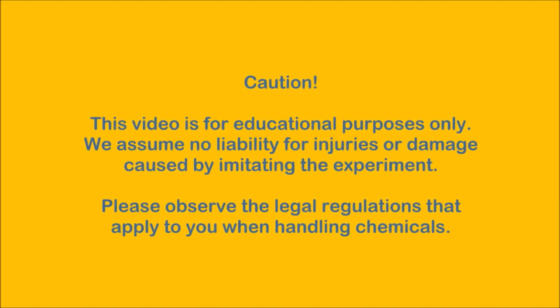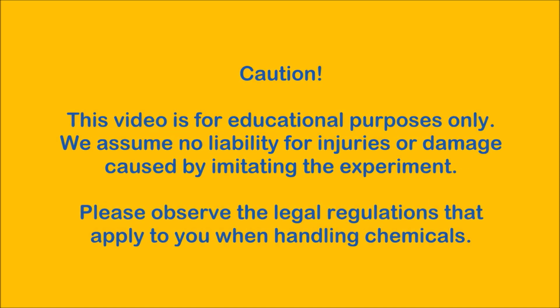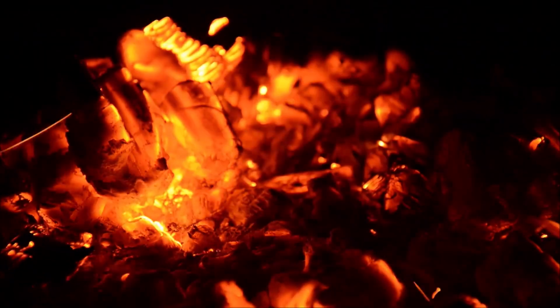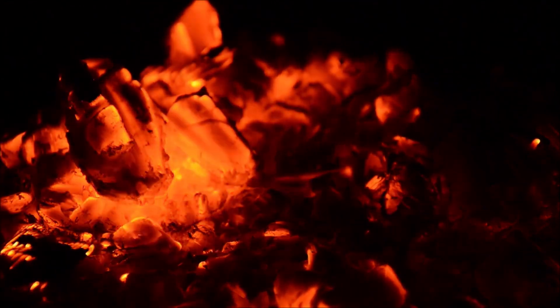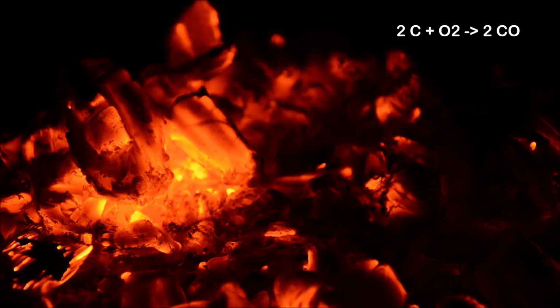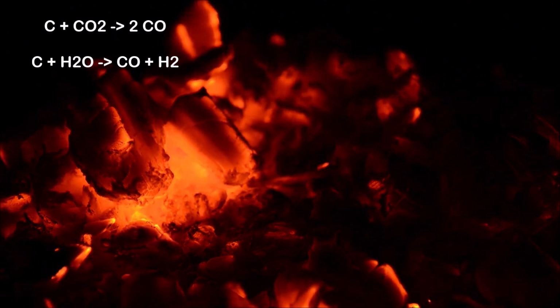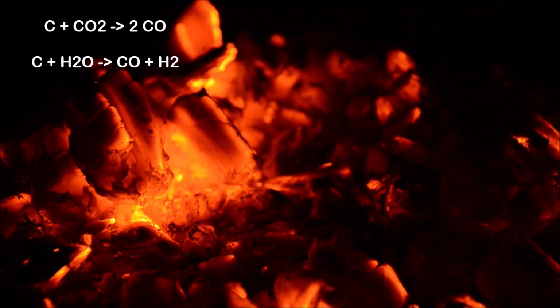Anyone who knows this channel already knows this warning. If you are here for the first time, please skip back and read carefully. Carbon monoxide is a colorless and odorless gas. It arises from the incomplete combustion of carbon-containing substances with insufficient oxygen supply. It is produced industrially by injecting carbon dioxide or water vapor into white-hot coke.